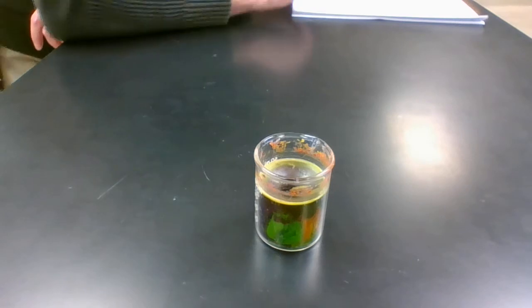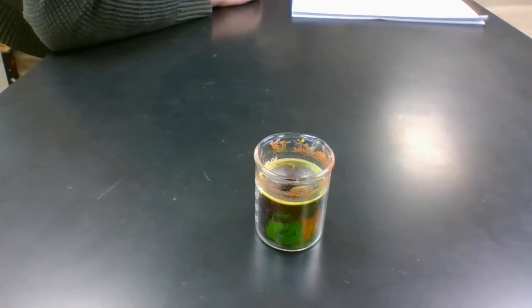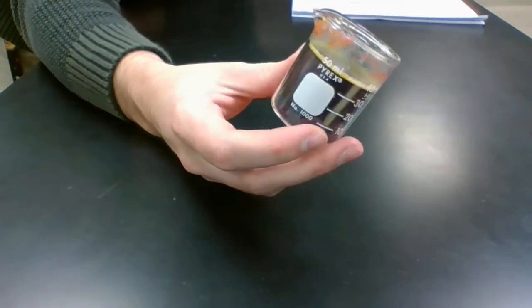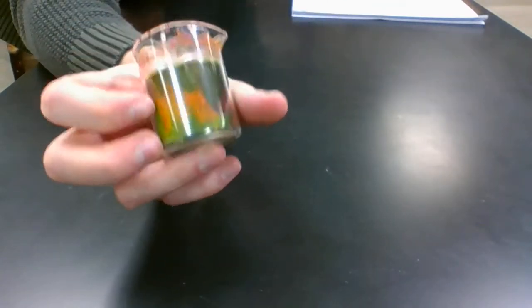Now each crayon was about 4.8 grams. So we can figure out a couple things about this little beaker of melted crayons. You can first try and figure out if this is a pure substance or a mixture. Again, just by looking at it, you might be able to tell.